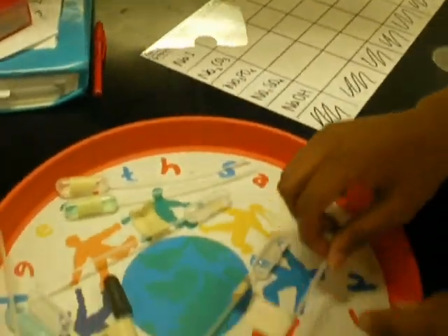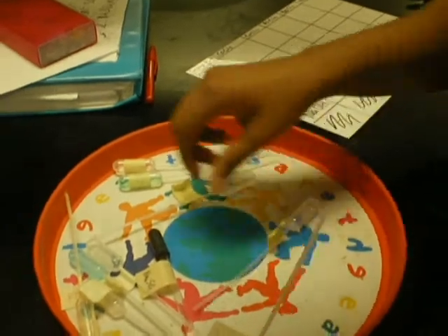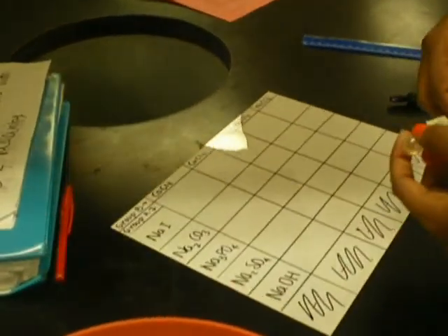So first we're going to do the first box. That is cobalt chloride and sodium iodide. You'd want to put 4 to 5 drops for each square, for each compound. 1, 2, 3, 4, 5. And when you're putting it back, make sure that they don't contaminate the other pipettes. Now let it sit for a while and let the compounds react.